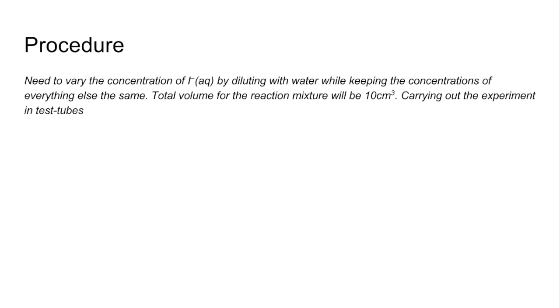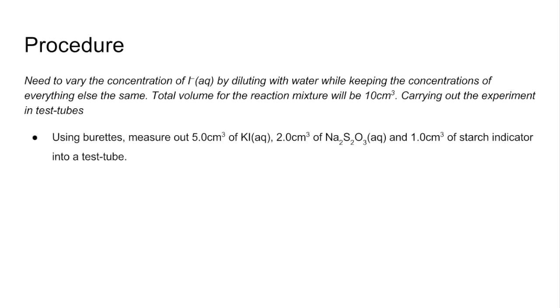Using burettes for accuracy, I'll measure out 5 cm³ of KI solution, 2 cm³ of sodium thiosulfate solution, and 1 cm³ of starch indicator solution into a test tube. The reaction won't start until the peroxodisulfate ions are present.